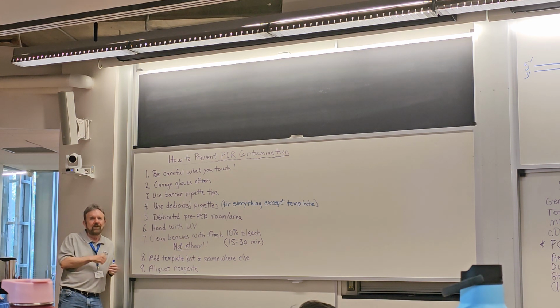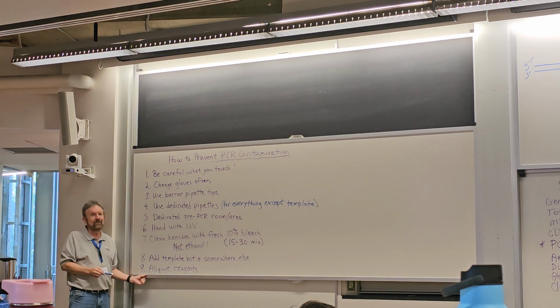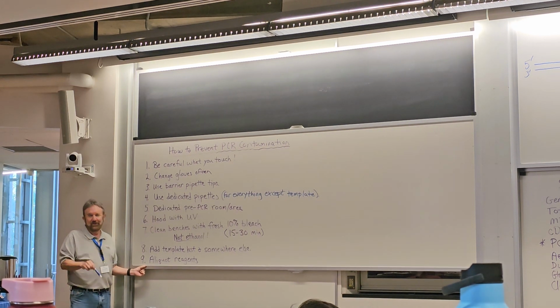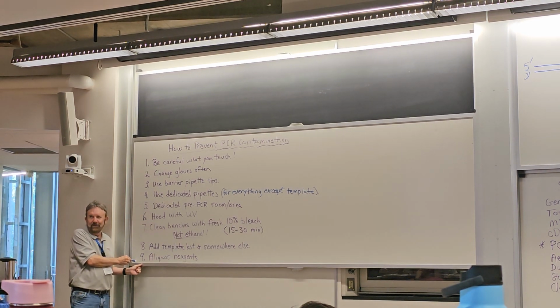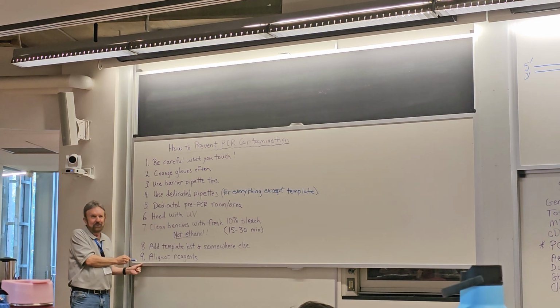So what you want to avoid is everybody using the same tubes to get their reagents, because one person makes a mistake and then, if everybody else was setting up reactions on the same day, everybody's stuff is messed up, right? So, really easy to do, really inexpensive, will save you a lot of money and a lot of frustration from various people in the lab, right? I would say that if somebody does it once, you give them a new set of reagents, they do it again, a new set of reagents, they do it again, you put them on a different project.